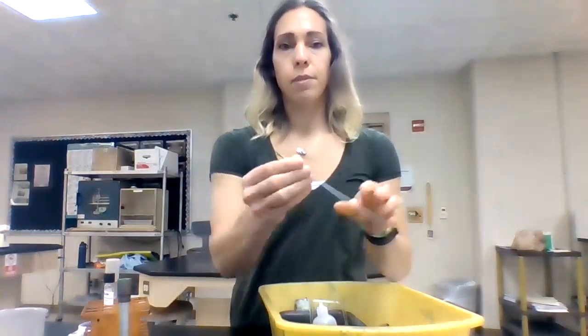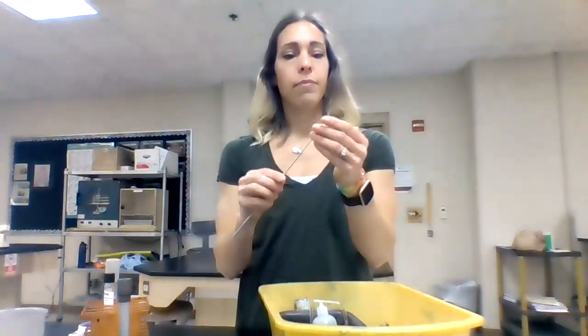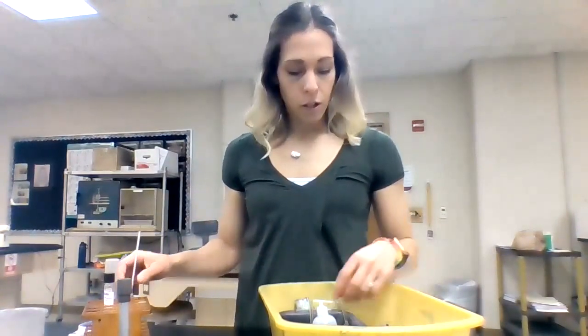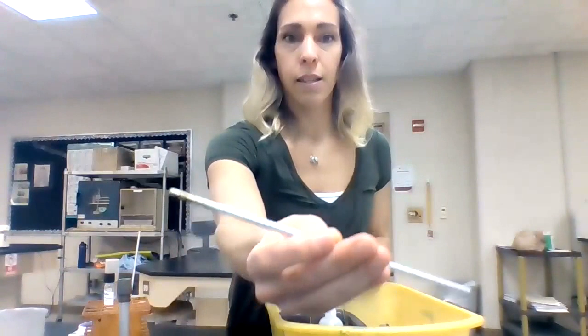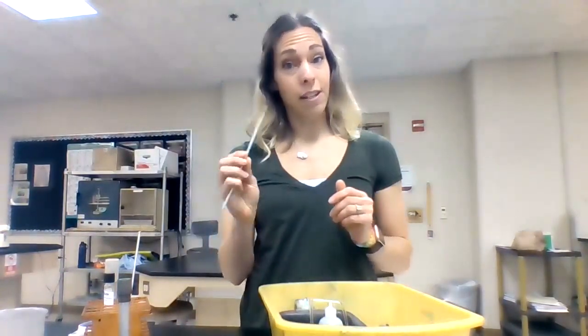Inoculating loops have a loop at the end, they're metal, and you could have one or two of these. You will also have an inoculating stab, which looks exactly like the loop except it has no loop on the end — it's just like a little metal stick.